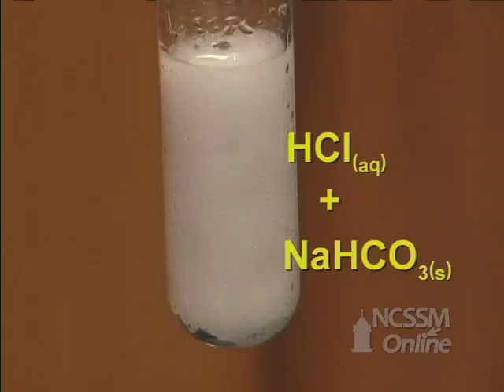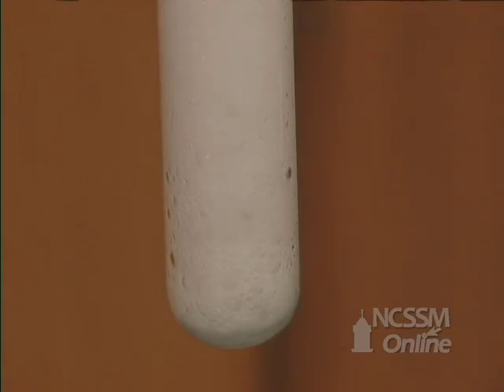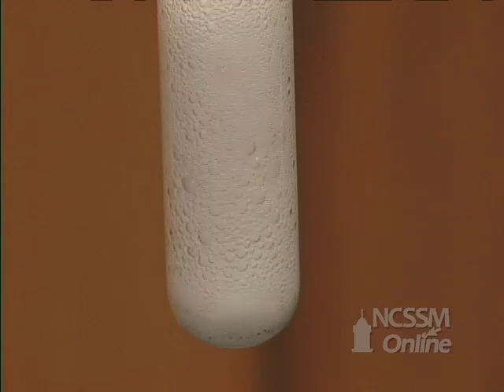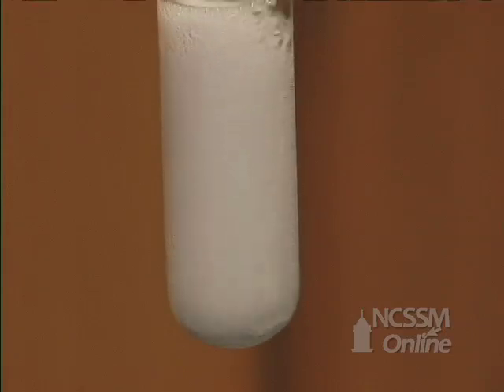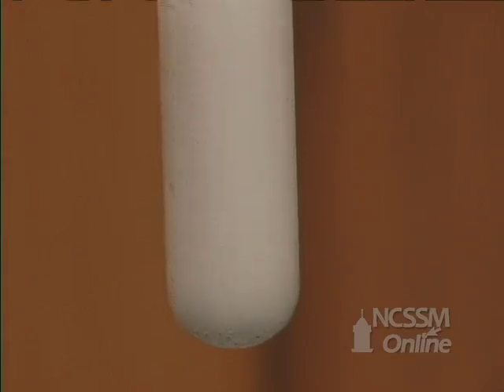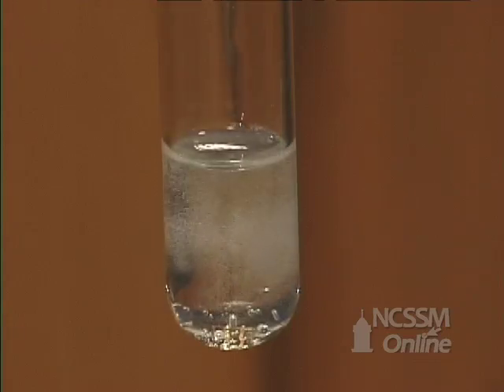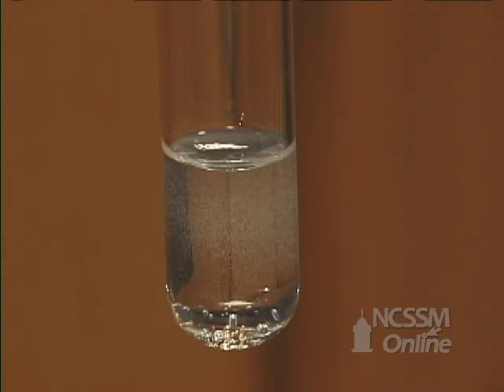The hydrogen carbonate and hydrochloric acid react rapidly to form carbon dioxide, water, and sodium chloride. A colorless solution of sodium chloride is left at the end of the reaction.